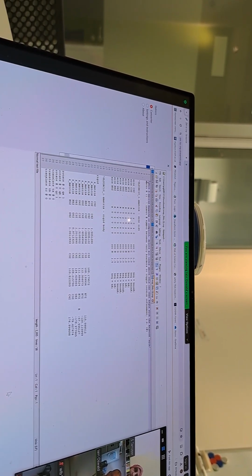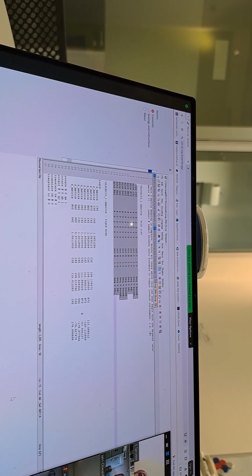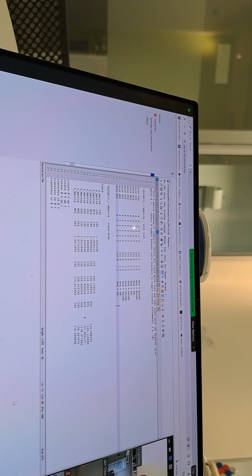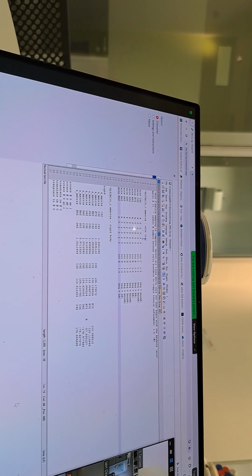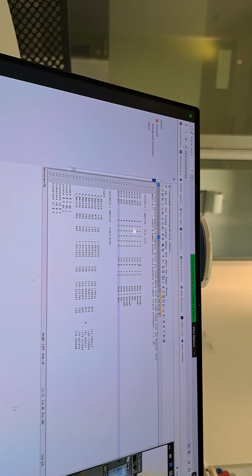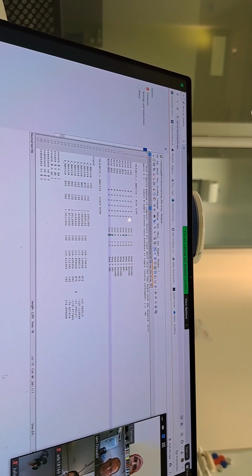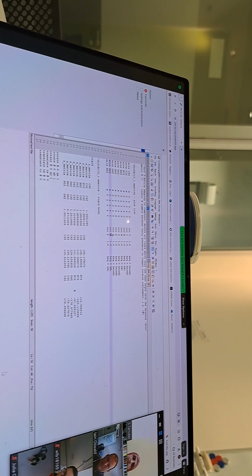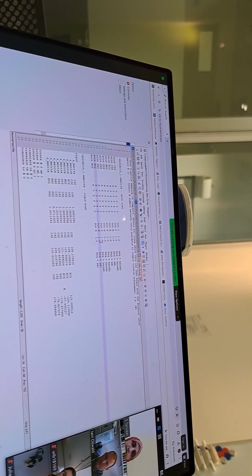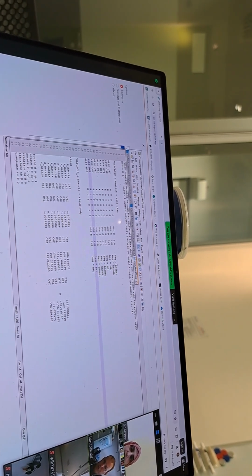And so you can see here that you've got your positions in terms of your basis vectors, your A, B, C. So that'll be X coordinate, Y coordinate, and Z coordinate. You've got your occupancy of whatever atom it might be. So if, for example, you're doing neutron, then you might need to change these H's to D's. You've got an occupancy saying it's 1, so that all the atoms are there 100% of the time. And then you've got this thermal parameter over here.